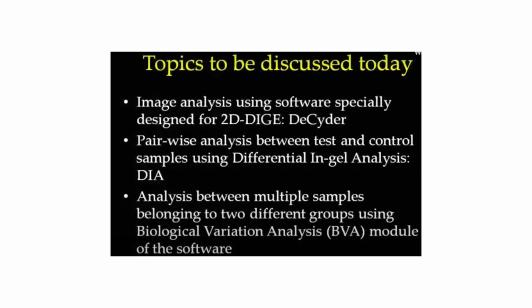I'll not be talking about how exactly the software can be used, but about how 2D DIGE is performed and what the benefits of it are. After doing the experiment, how we use the software is what sir talked about in this lecture, and you can go through that specific lecture.